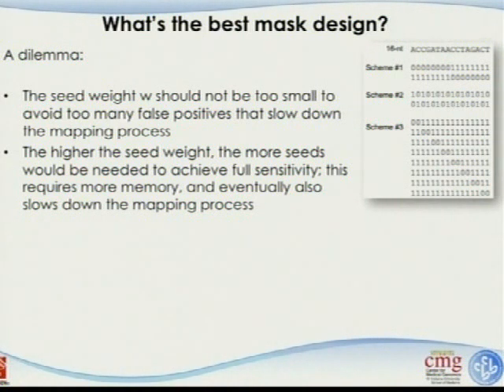And Jake's point is, why don't we do the shifting to account for this, and that will be very complicated. Most alignment algorithms allow 2 nucleotide mismatches. The notion for that is there's 1 SNP and also 1 nucleotide allowed for sequencing error. Once you have 2 nucleotide mismatches, and those 2 can happen anywhere, how you do the shifting becomes an issue. You may end up spending more time to figure that out. Okay?